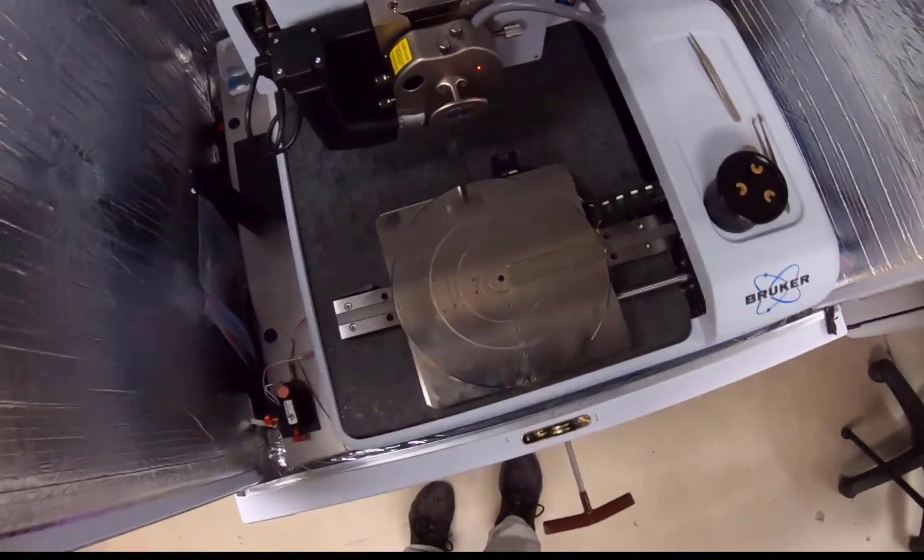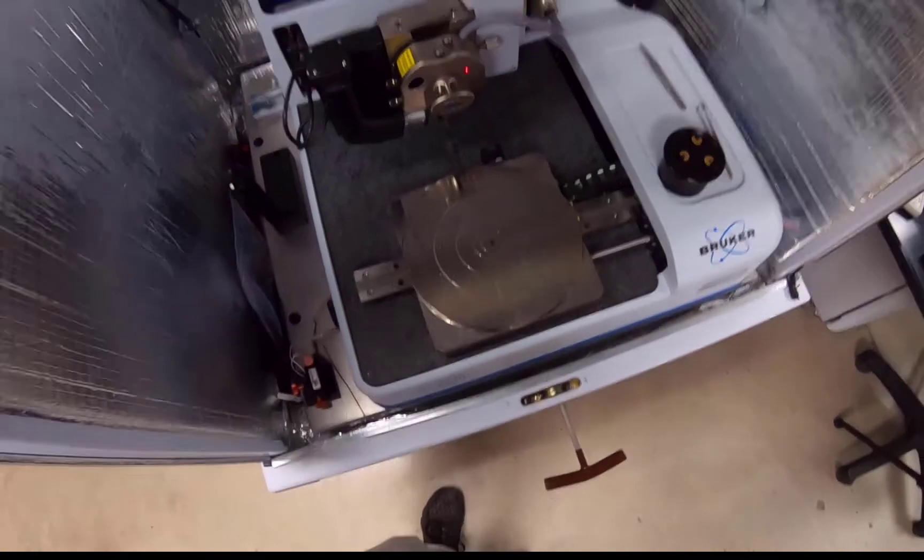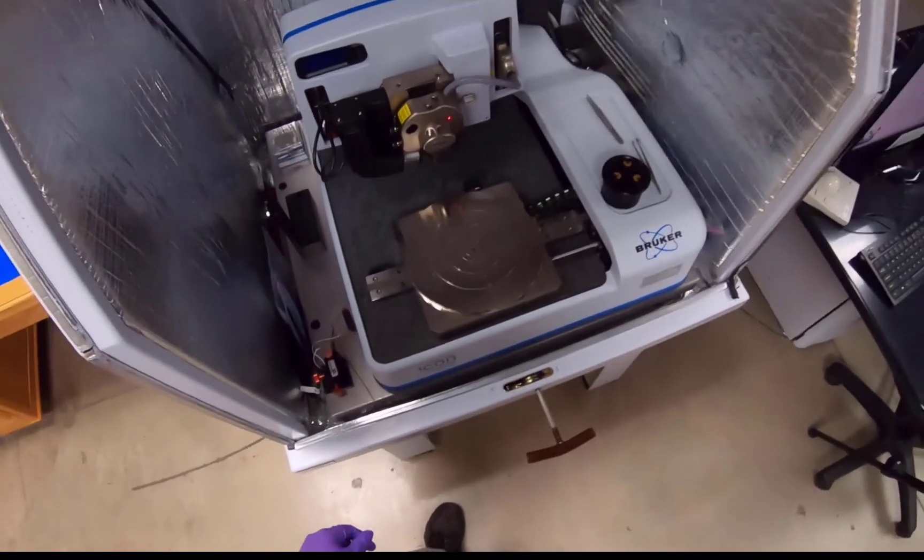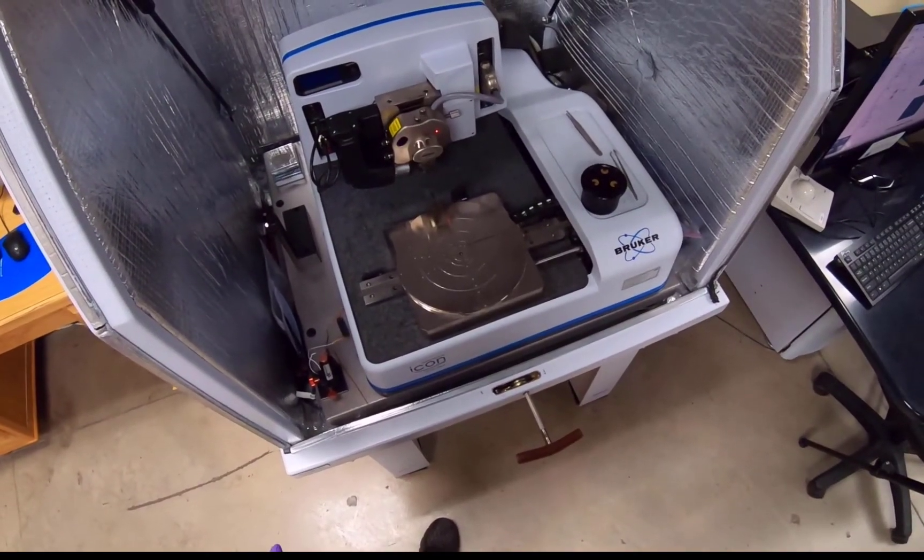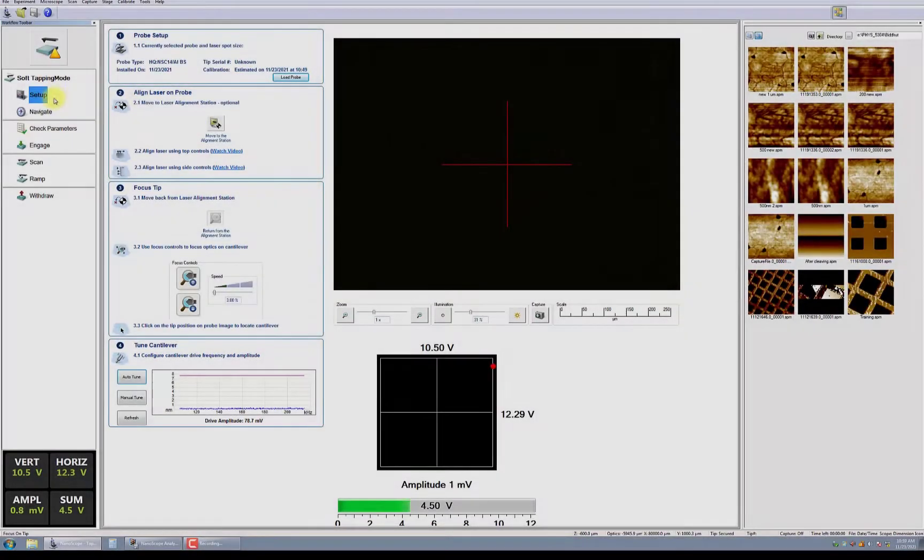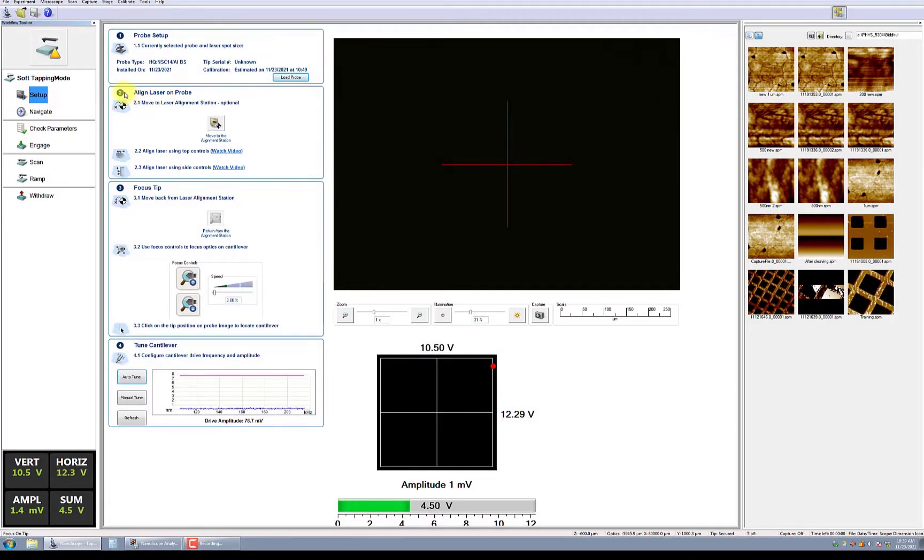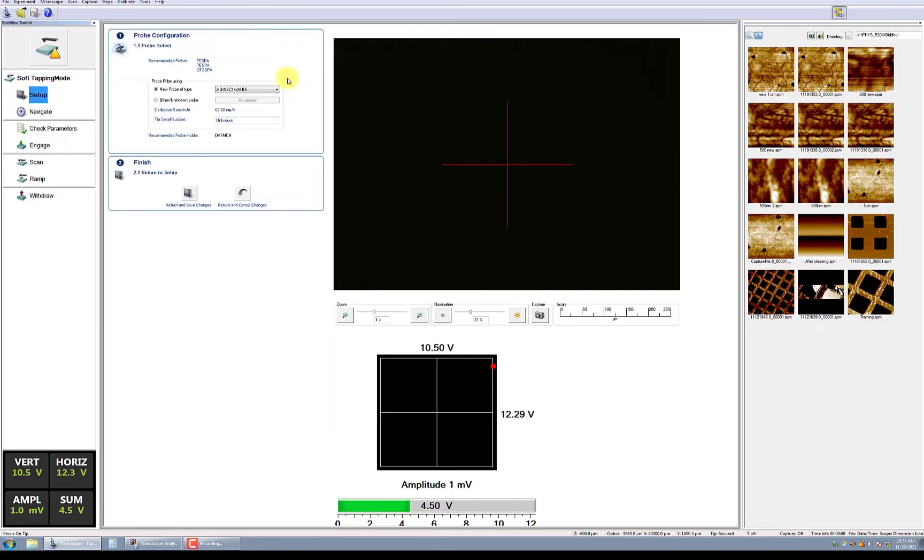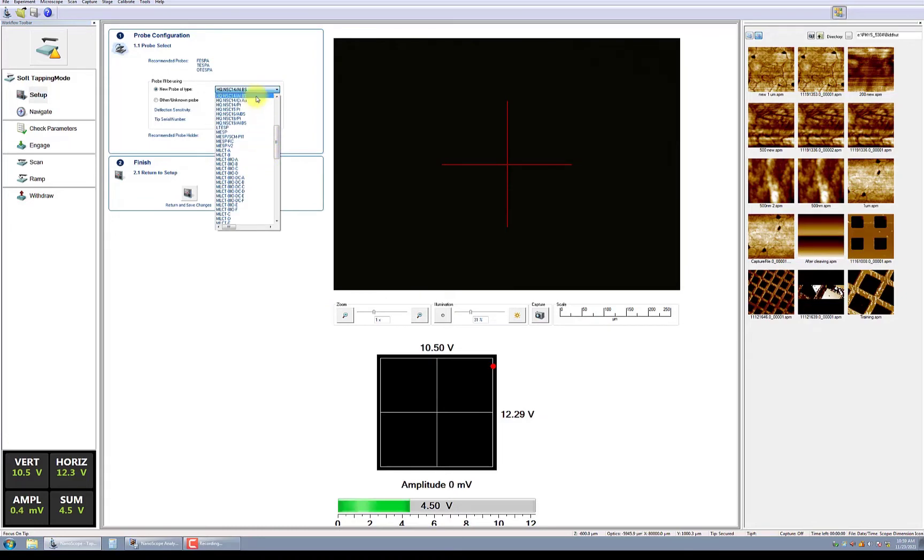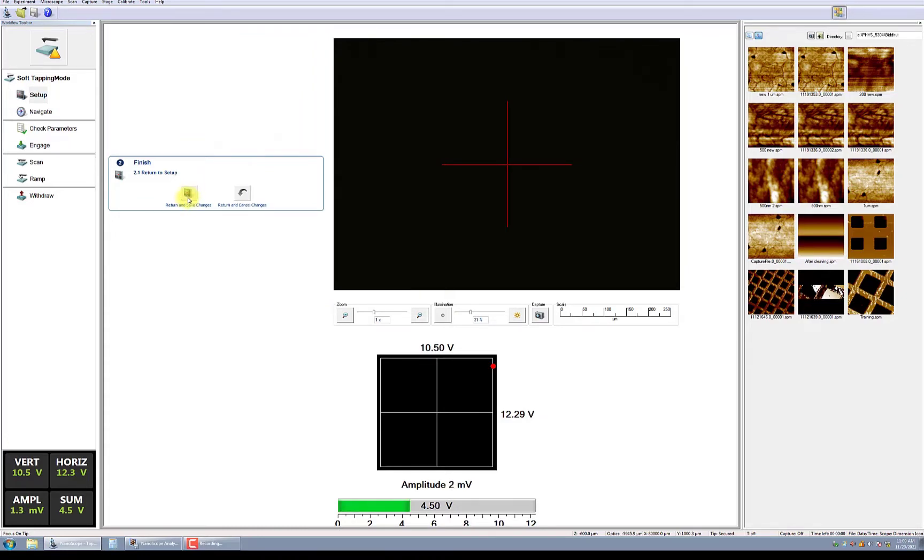Now it's time to let the software know what kind of probe we're using. To do this, select Setup in the Workflow Toolbar. Next, press Load Probe. In the probe configuration, select the tip you will use from the database. And then finally, press Return and Save Changes.